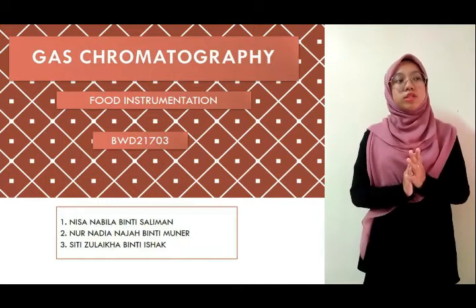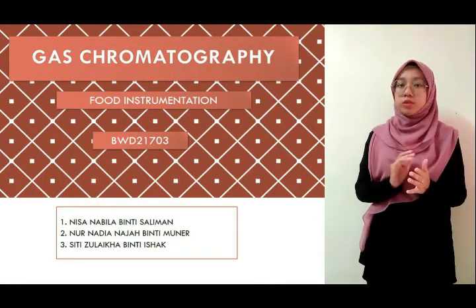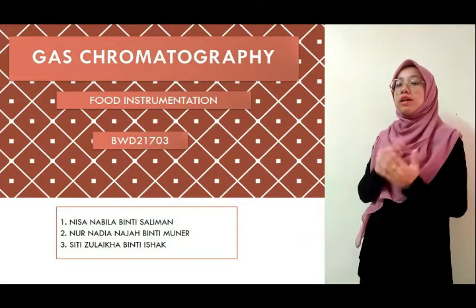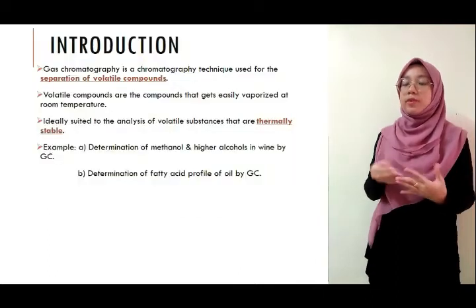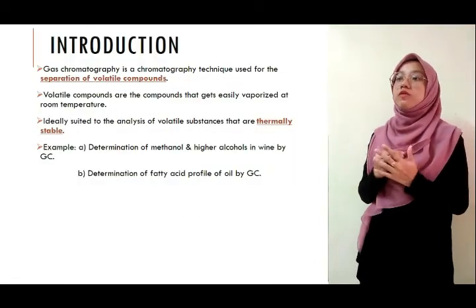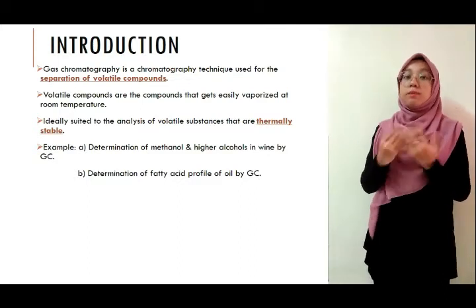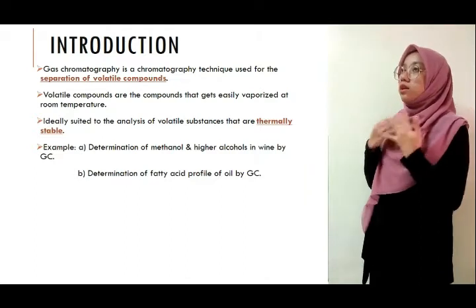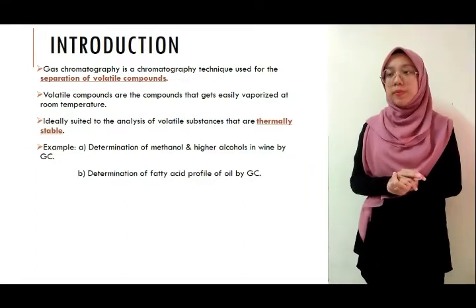Okay, today I would like to present on the introduction and the principle of gas chromatography. So first, let me define what gas chromatography is. GC is the chromatography technique used for separation of volatile compounds. So what is meant by volatile compounds? Volatile compounds are compounds that easily vaporize at room temperature.